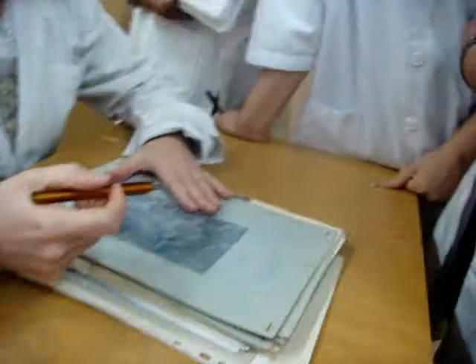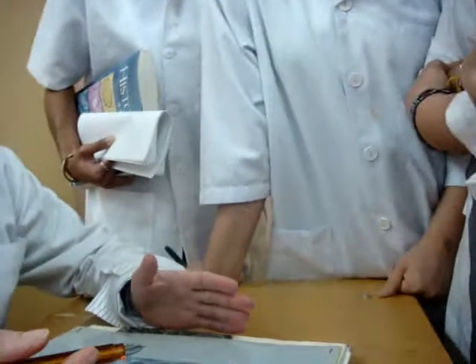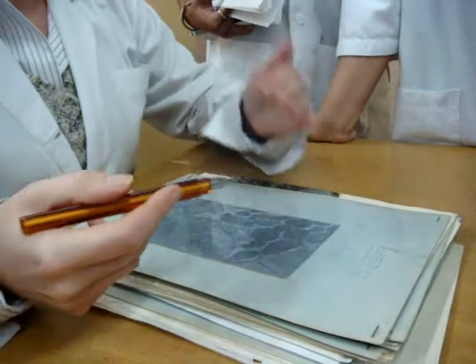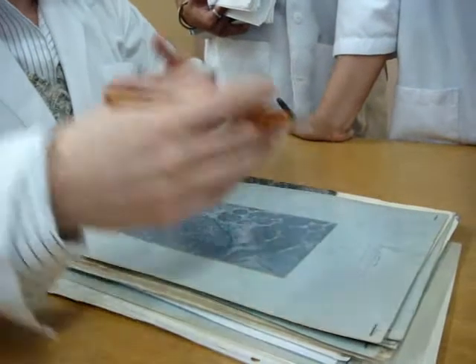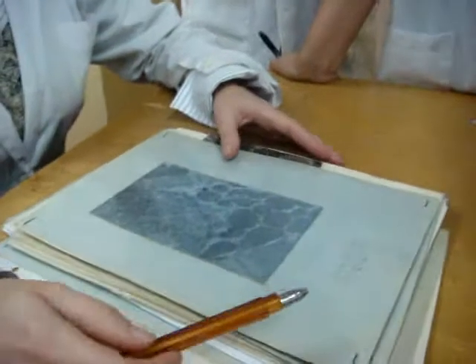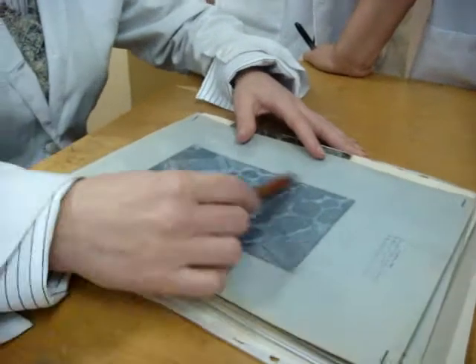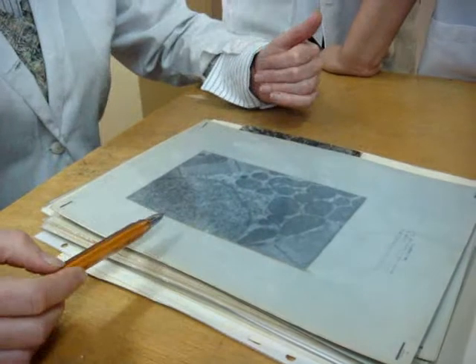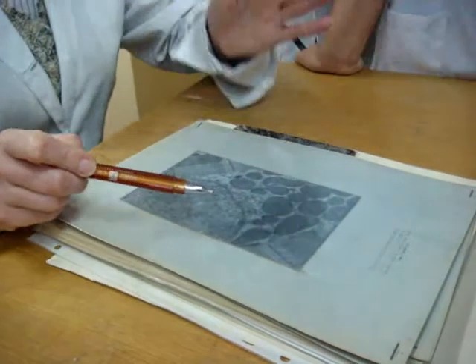And if it's possible, refer them to the tissue. And if it's possible, after that, identify what type of cells are in this tissue on the electron micrograph. So let's look. Is this one cell or more than one cell? This is part of one cell. We can't see the cell membrane at all.